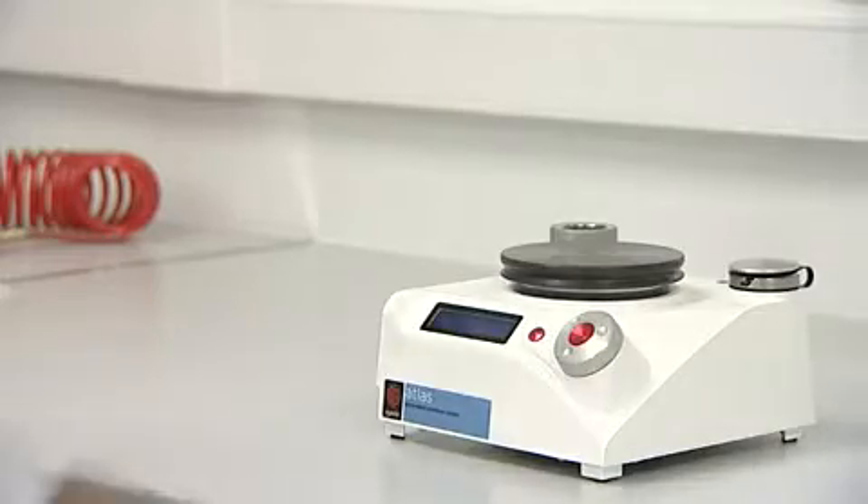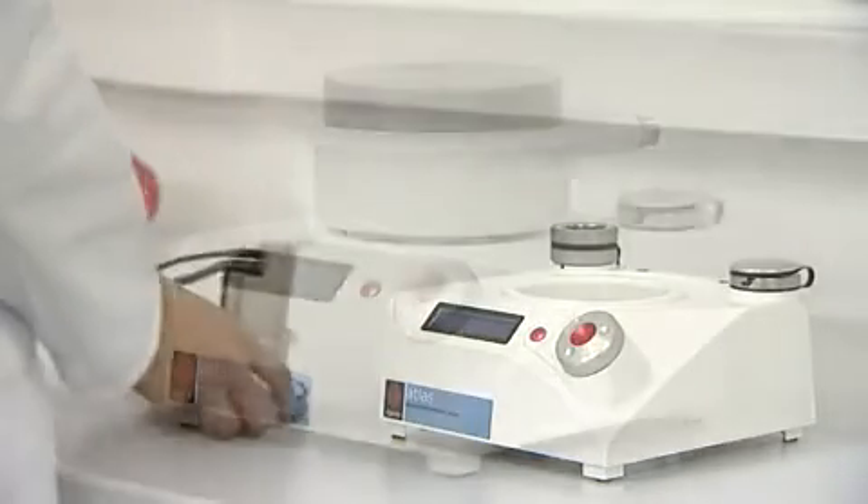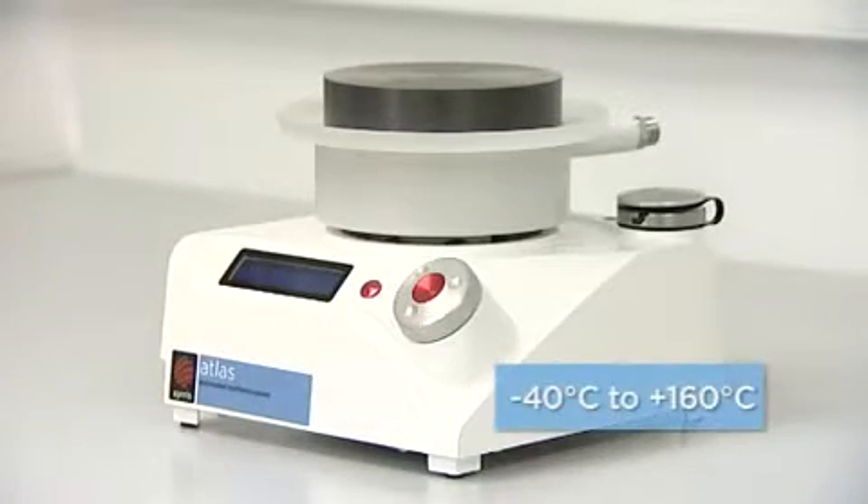The Atlas hotplate can also be substituted for a hot and cold plate, with the heating and cooling circulator controlled by the base.